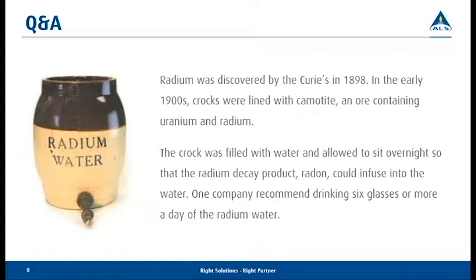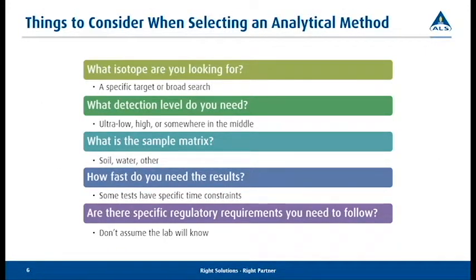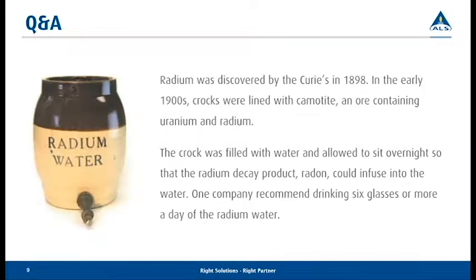So, but that was basically it. This was an overview. I do encourage you, if you have direct questions on the different methods, radium is one of the ones that is probably the most complicated because there are so many choices out there and options. But again, the part that is good to say is, what do I need? If you ask these main questions here, you can get good help and discuss things with whichever laboratory you want to work with, and they'll be able to help you figure out what method will work best between you guys. So we always want to be able to help you and give you results that will meet your needs. So unless there's anything else, that is all I have.